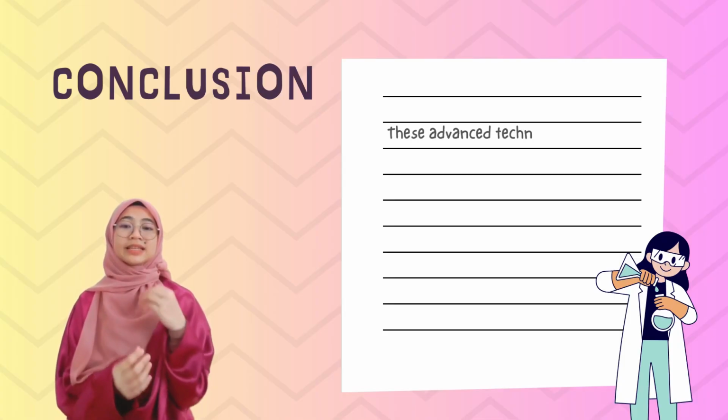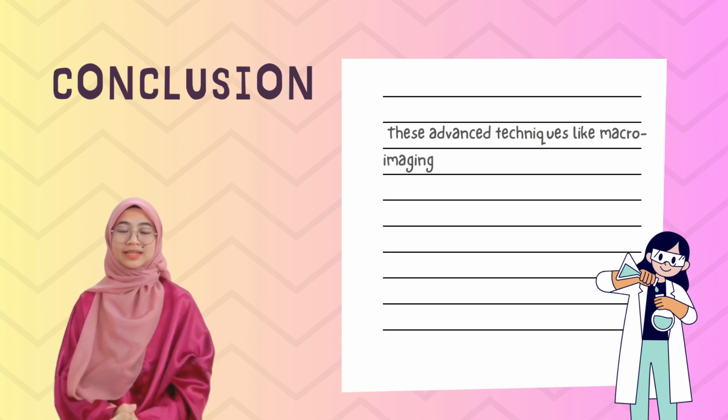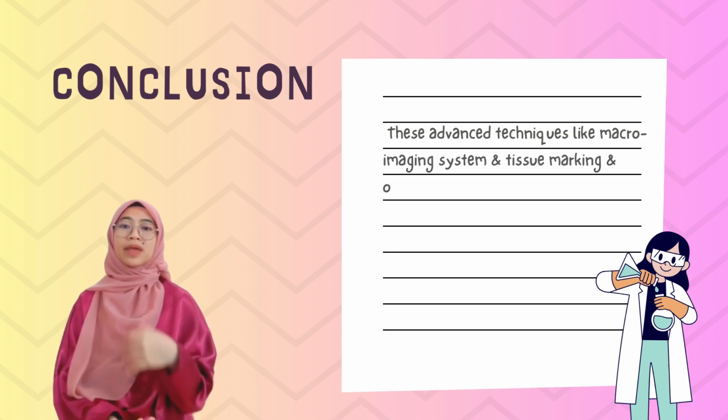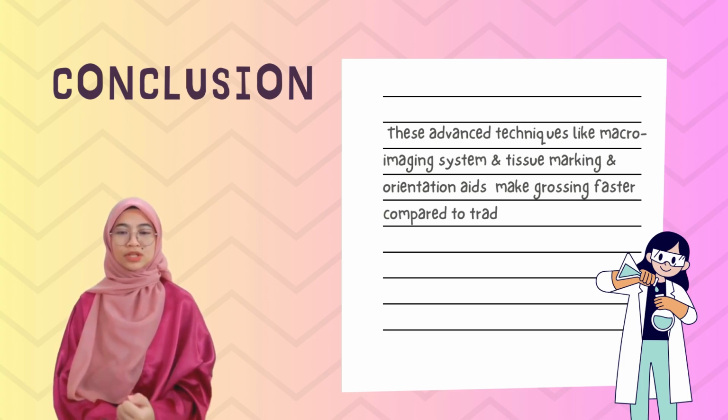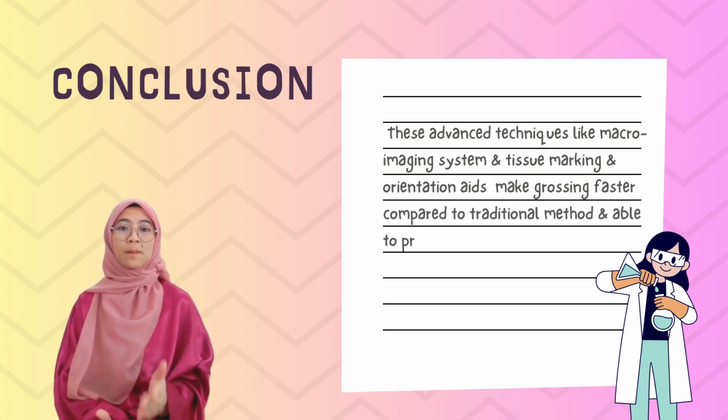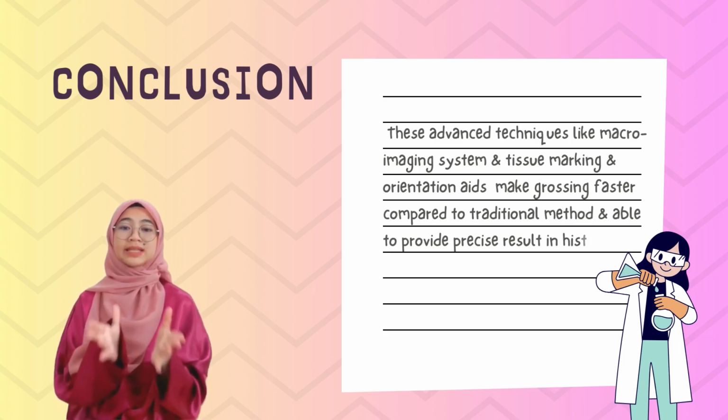In the end, these advanced histological techniques in tissue grossing make grossing faster and more precise, setting a strong foundation for accurate diagnosis compared to traditional methods in tissue grossing.